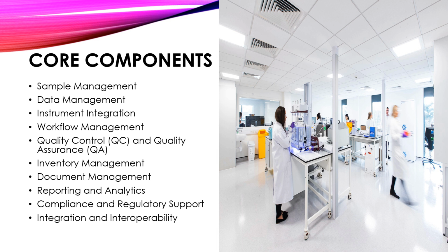Quality control and quality assurance. A laboratory management system supports QC and QA, quality control and quality assurance processes, by providing tools for instrument calibration and maintenance scheduling, proficiency testing, results verification, and compliance monitoring with regulatory standards such as CLIA, CAP, or ISO.